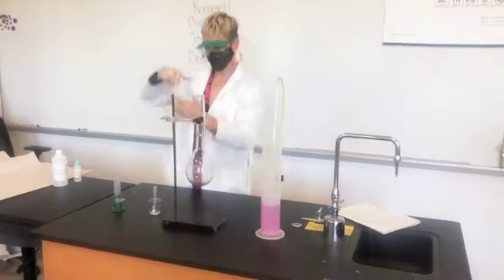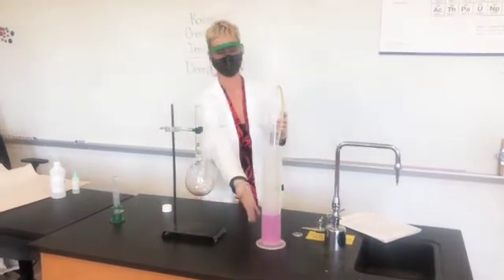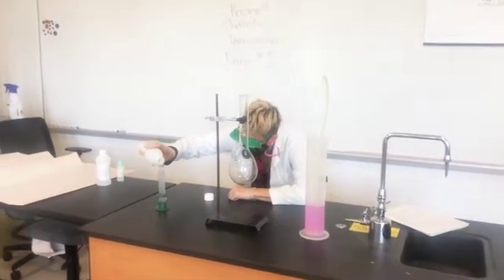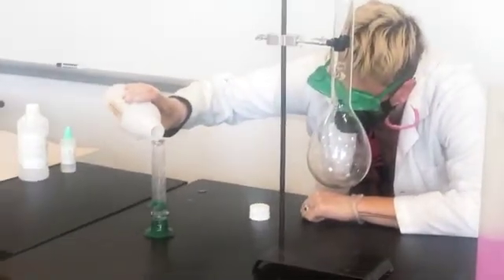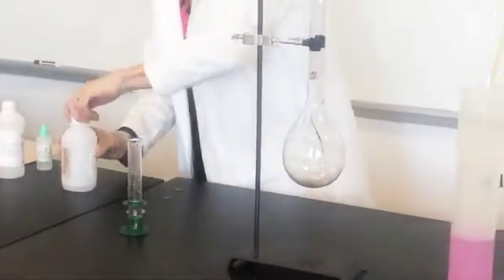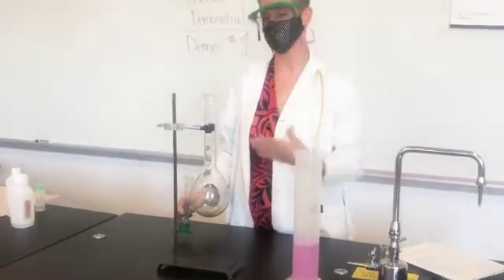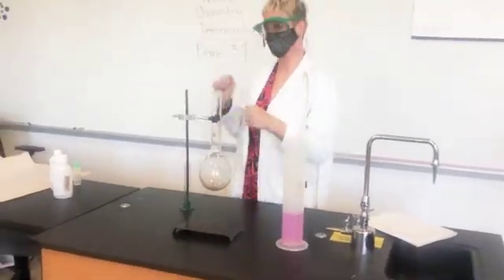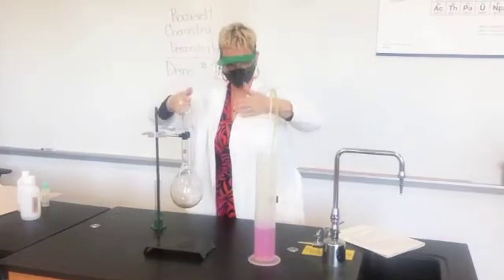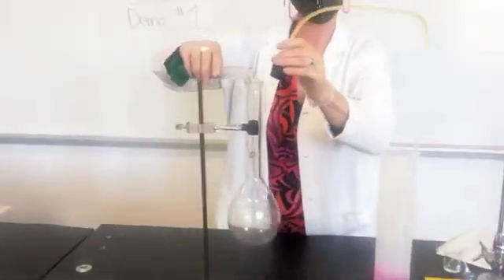All right. I'm going to take some of my nitric acid and measure out about 20 milliliters. So I'm going to have this reaction happen. As you're starting to see this happen, make sure you're writing down as much as you can — jotting down notes you can share a little bit later. Mr. Palmer is going to zoom in and get a little more of the details. Here we go, and I'll continue the story from Ira Remsen.